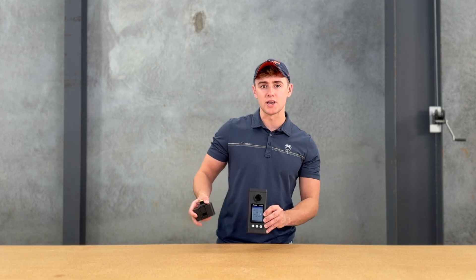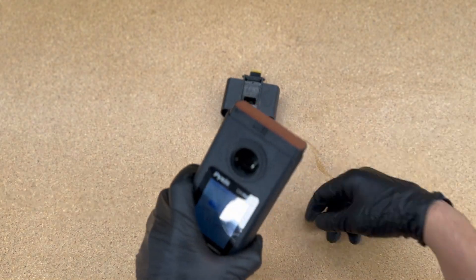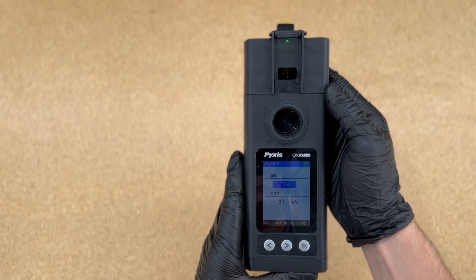You can keep the module separate off to the side, or you can pop off the top of the OxyGo and snap on your pH ORP module to make it one big handheld meter.